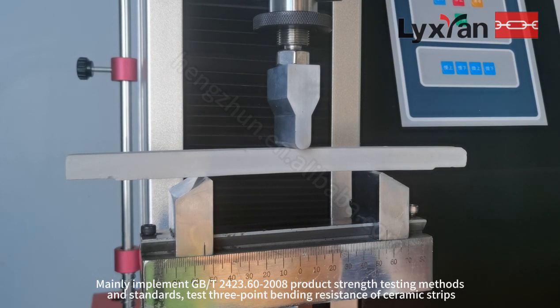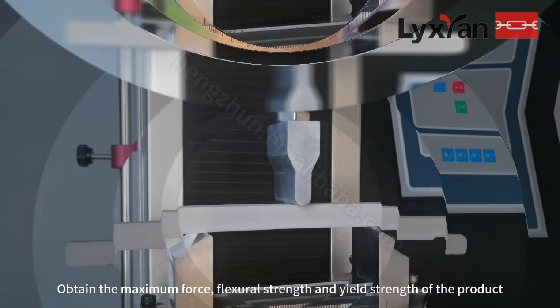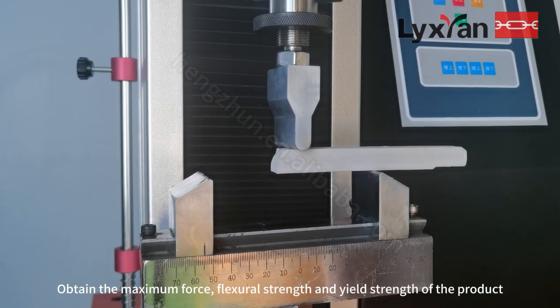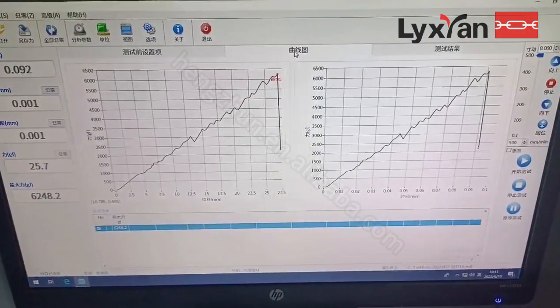It tests the 3-point bending resistance of ceramic strips to obtain the maximum force, flexural strength, and yield strength of the product. Effective testing width of 2 to 100mm can be widened.